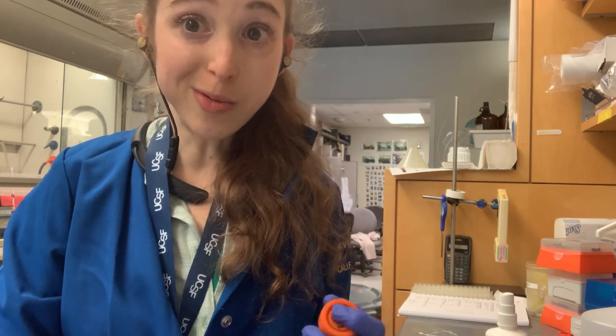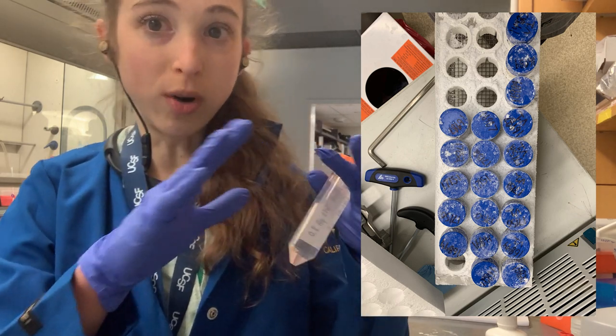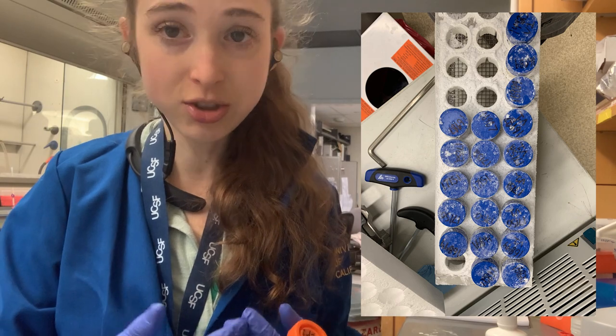There's other information you might want. For a protein expression pellet, I normally put the number of tubes — like 'one of four,' 'two of four,' that sort of thing — as well as the protein construct.